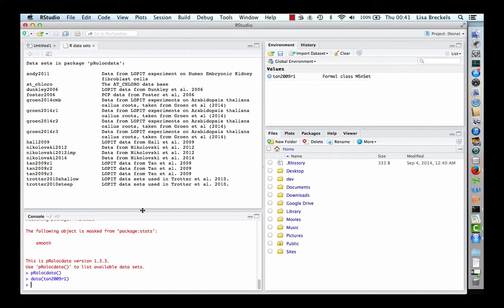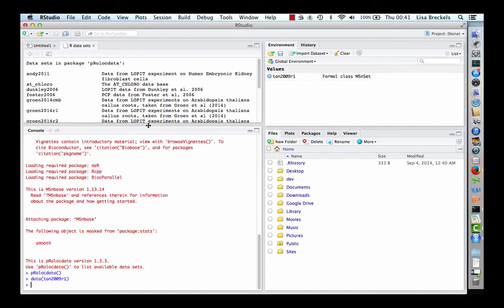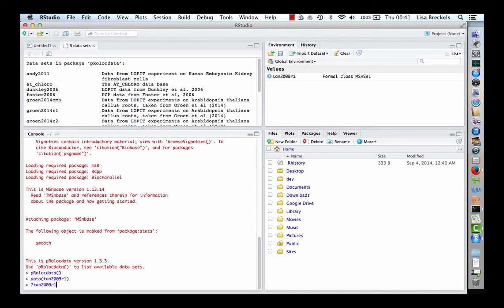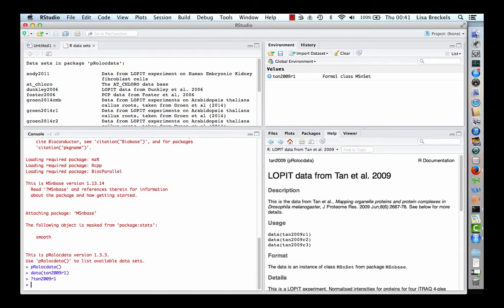To get more information about the experiment, type question mark and the name of the dataset. Now you can see in the help pane information about the dataset. Here we have loaded a dataset from an experiment back in 2009 on Drosophila.